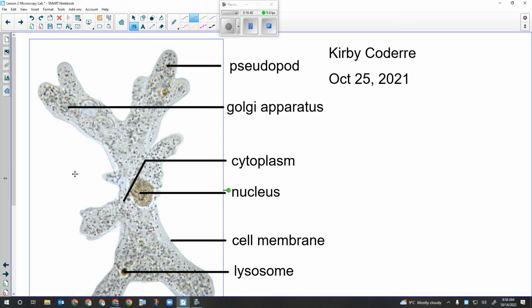Because sometimes people do that. They put the picture in the middle and they got lines coming out of it in all different directions, and it literally looks like the specimen's exploding, okay? Which is not very tidy, right? So we want all of the labels to be off to one side, and we want them all to be straight lines, okay? They should come out and end horizontally.